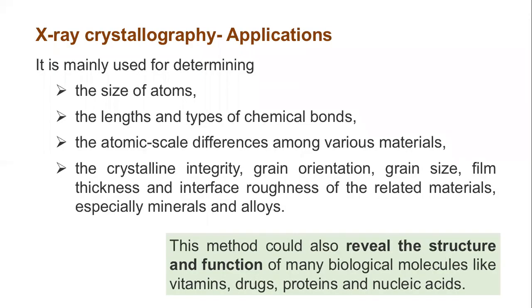So, speaking about the applications, we have already been saying it helps us understand the structure. It helps us understand the size of the atoms, the length and type of the chemical bonds, the atomic scale differences among the various materials, then the crystalline nature, the crystalline integrity, how the grains are oriented within the crystal, the size of the grains, the thickness of the film, interface roughness of the related materials, especially in the case of minerals and alloys.